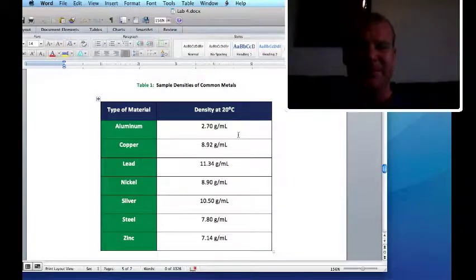Aluminum's, truth be told, I can tell what material a thing is a lot of times by the grain pattern. Aluminum has a sort of white color if you look really close to it, and zinc has this kind of web sort of color to it. We're not going to send you silver washers. Come on. Silver costs too much money, so it's not going to be silver.